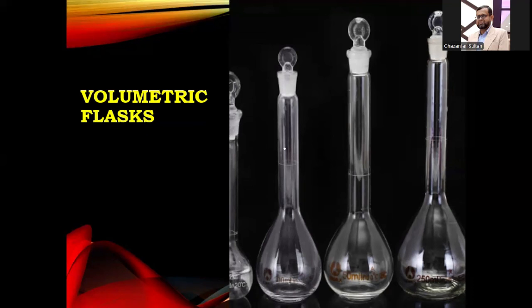And we can also use these flasks for making dilutions, especially in biochemistry laboratories, where we have to make different dilutions. In analytical chemistry as well, we used to make dilutions. So this is all about the apparatus or the glassware used during the titration.